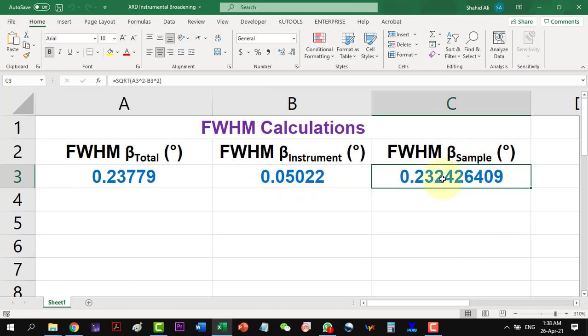As our peak was Gaussian in shape, so we will consider this expression. And here is the instrumental contribution subtracted value of the FWHM. We can utilize this value for the calculation of many parameters from the XRD data.